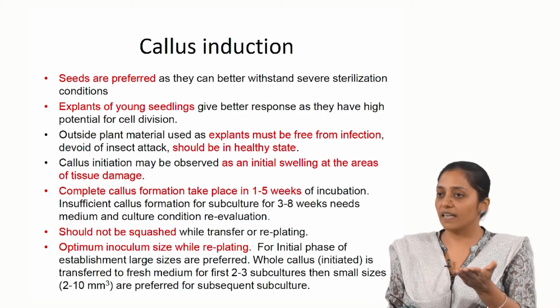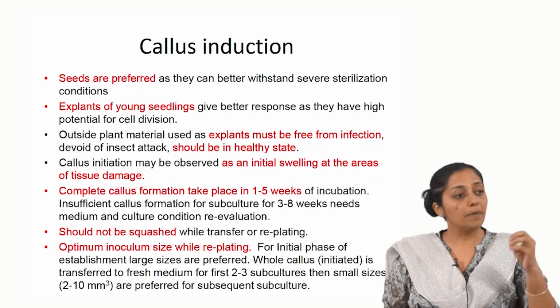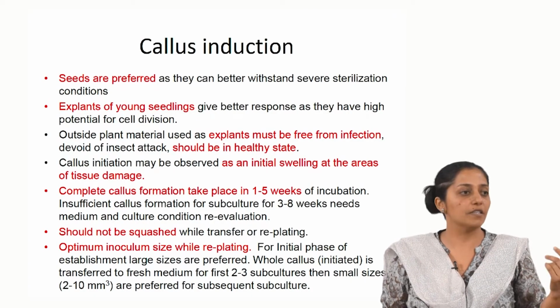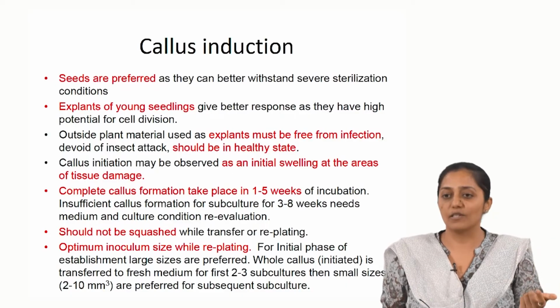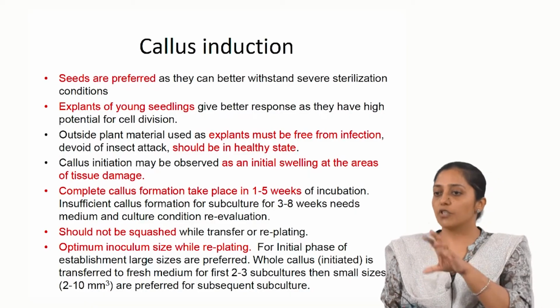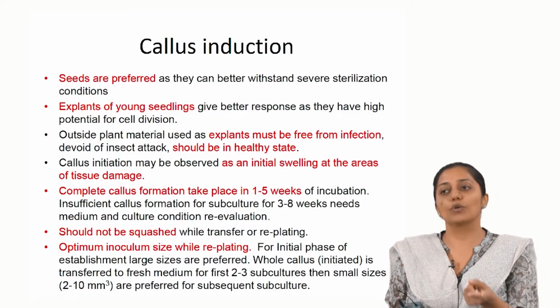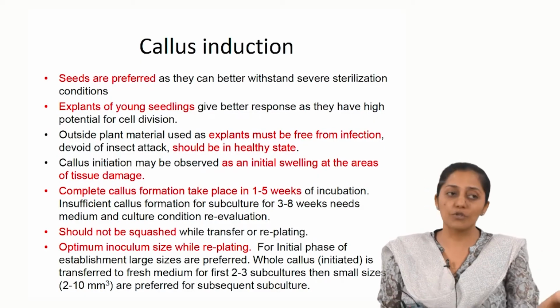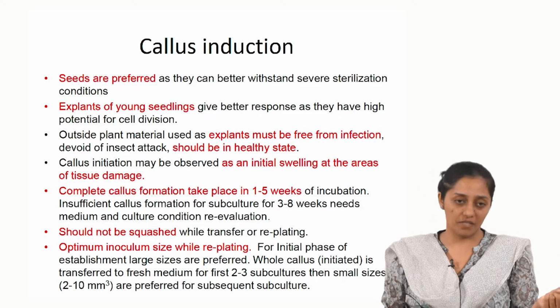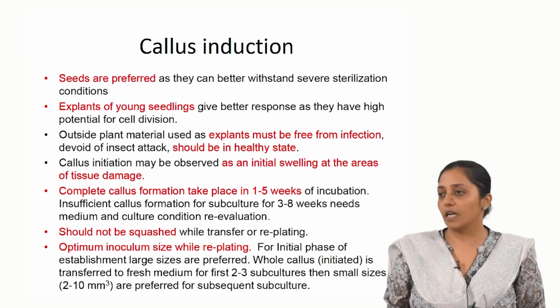So, for example, in azadirachtin, seeds generally have the highest yield of azadirachtin. So, we picked up a plant which is, I think, a Trivandrum variety which was very high yielding in comparison. There were plants in IIT Delhi also, but then we made a comparison, and we picked up the plant from South India which was showing high yield, and from that plant we picked up the seed because the seed is known to have highest yield, and that seed was used to generate the callus. So, what I mean to say here is it is not necessary that you need to pick up the seed only. You must pick up that explant or part of the plant which shows highest yield of that particular metabolite.